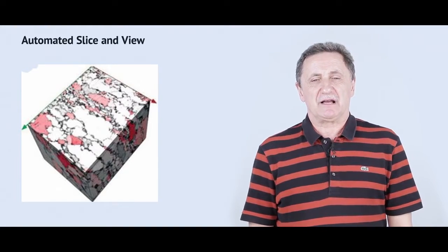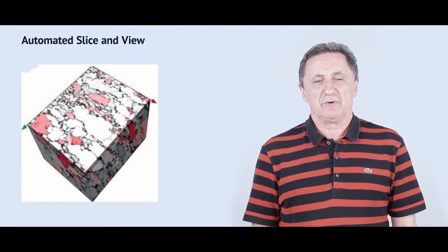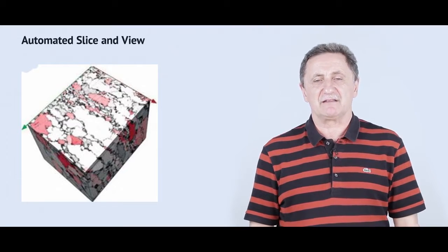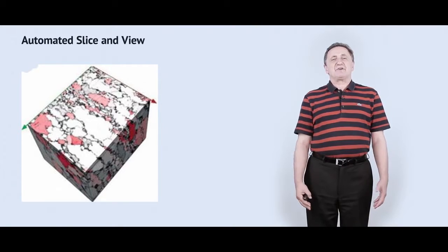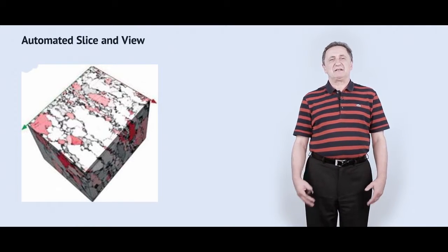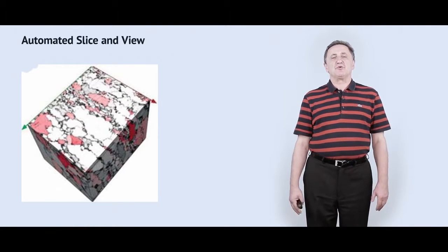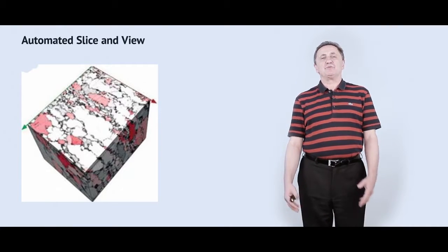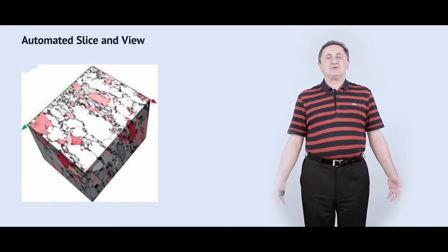So typically, as we discussed before, you will make a stochastically distributed cross-section of your material, and then investigate this cross-section. However, you understand that this is just one cross-section, and many times it's very useful to know the distribution of elements, of phases, of features along the volume of your sample. How can you do this?